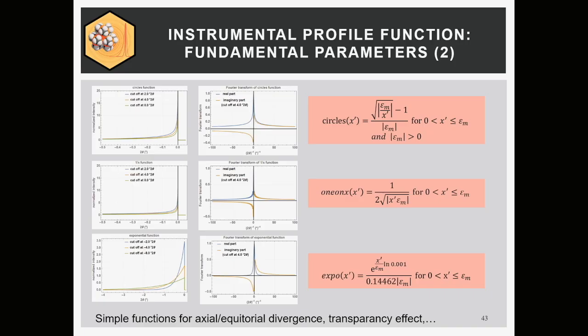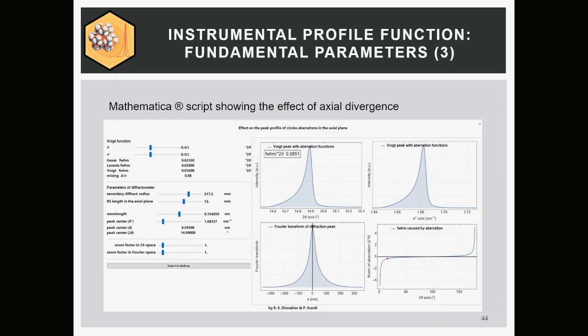Now we had this example of the transparency. So if you have a low absorbing powder and you put a kilogram in your sample holder, then the beam penetrates and penetrates and penetrates and reflects, and then you get this terrible asymmetric shape on the left side. But of course, when you have the effect, you have to describe it somehow, to a certain extent.